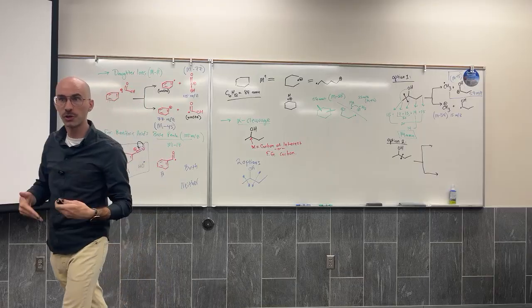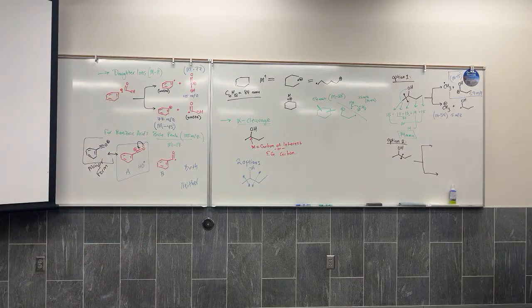Can you predict the 2 possible cations that come from this? Yep. Now can you figure out their masses? And do you see those masses on the structure? On the spectrum.